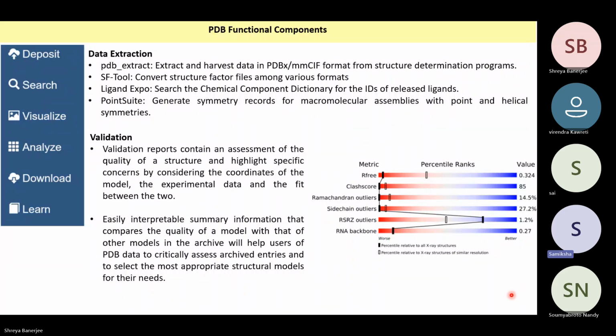We can take the values from here and say whether the protein structure is good or not. So why are we doing the Ramachandran plot? I am not understanding your question. We don't physically do the Ramachandran plot. The program that calculates the validity report already checks the Ramachandran plot. We don't have to separately plot it.